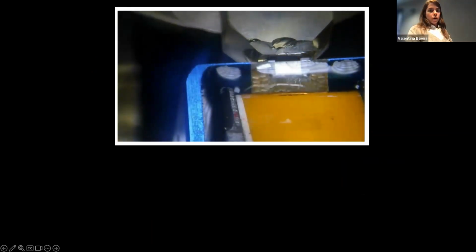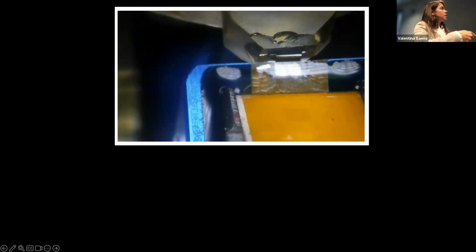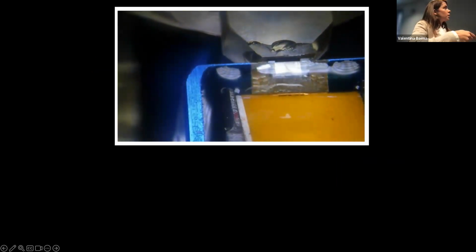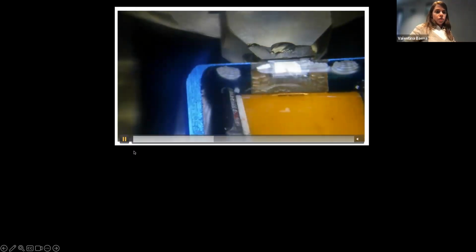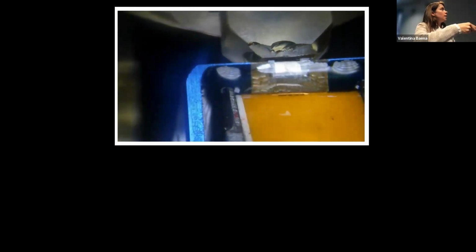So this is an example of what that looks like. Again, this is the snout of that tape collector. The tape is moving, so you can adjust the speed of the tape movement so that it matches your microtomy speed. Hopefully you can see this, but as the sections are being cut, they're pushing the previously cut section onto the tape. In this case, the tape speed is just a little bit faster than the cutting speed in order to prevent contraction of those sections.